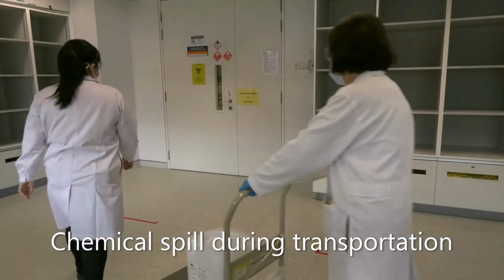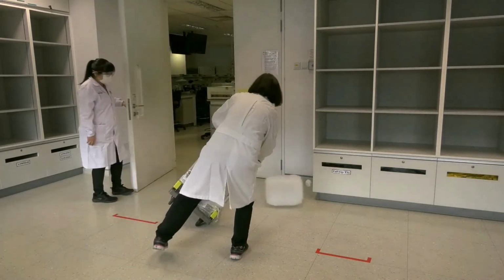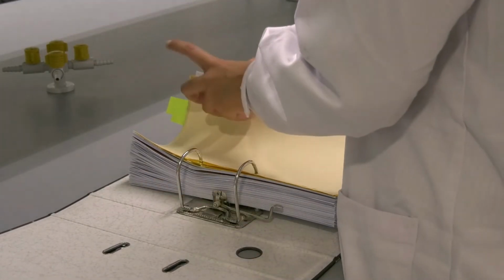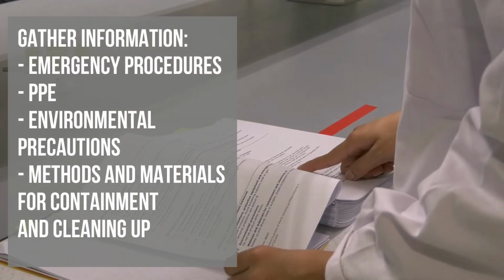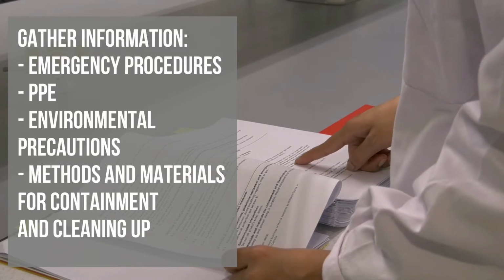One morning, two LT are transporting chemicals. Ouch! Spill responder reads through the SDS to find out more information about the chemical accidental release measures. This includes personal precautions, protective equipment and emergency procedures, environmental precautions and methods and materials for containment and cleaning up.